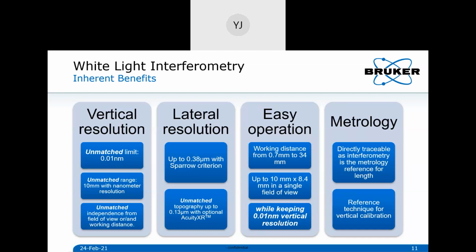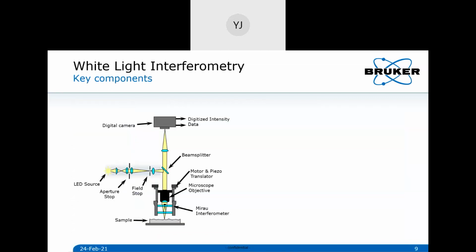What are the necessary steps to calibrate an optical profiler? Also a good question. Let me show you the schematic of the objective. All the things happen here. This is called the Mirau interferometric objective, and it has two plate beam splitters and a reference mirror. These are all housed inside the objective. This comes from the factory, so you cannot tamper with anything.